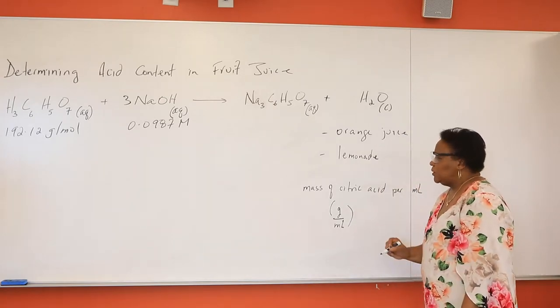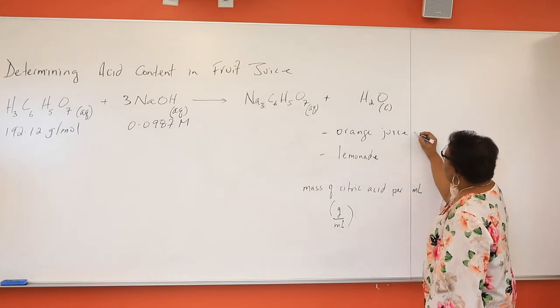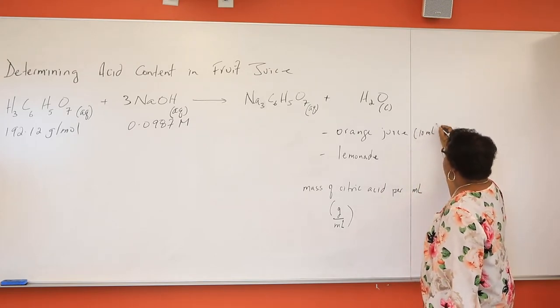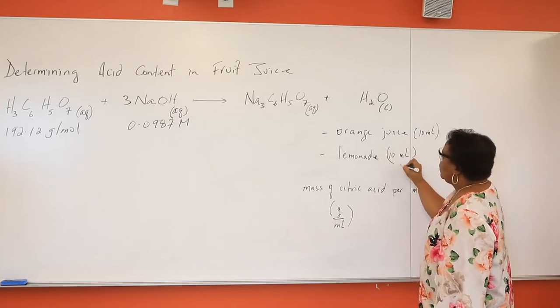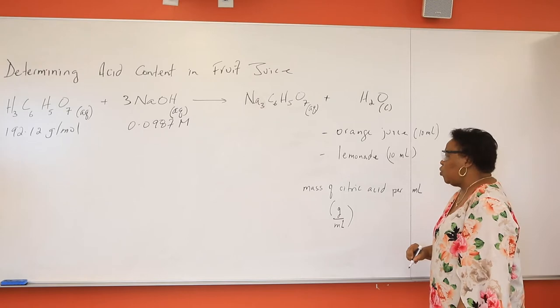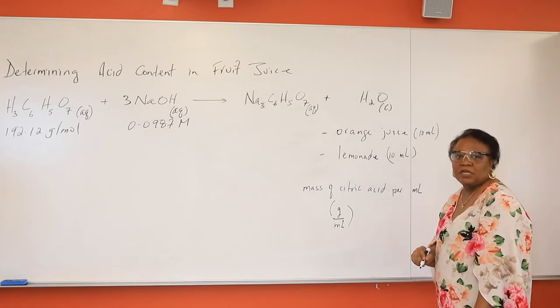In each experiment you are starting off with 10 ml of each of the fruit juices. We are going to dilute it with about 10 ml of water and then we are going to proceed with the titration.